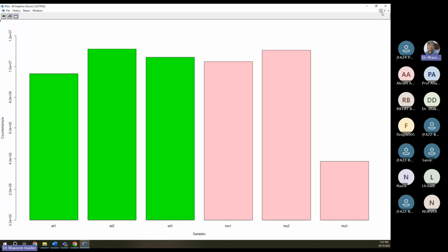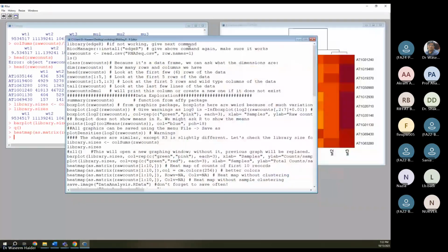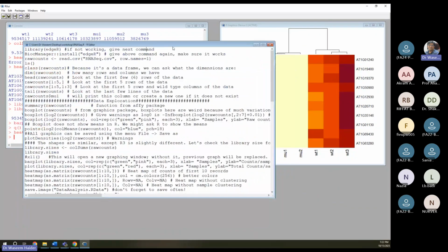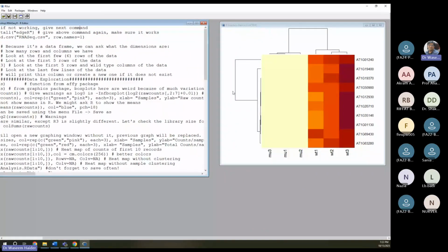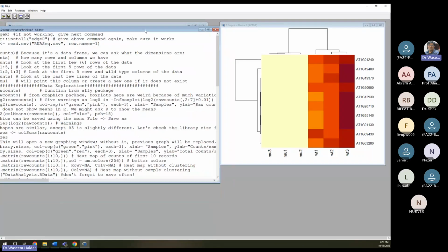Okay, so here we are. So bar plot, heat map, one of my favorites. So heat map. Actually, what it does is, let me make it smaller. I can keep it here. This is the beauty of this standalone R in R Studio. These panels are fixed, so you can't do like this all the time. Okay, here you just grab it and then you can move it freely.